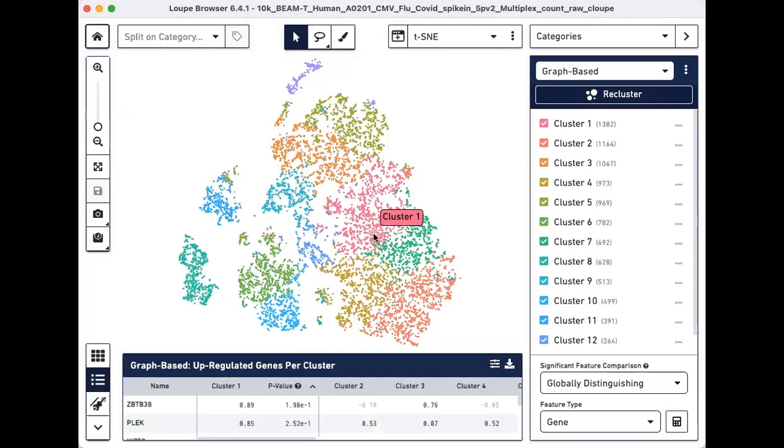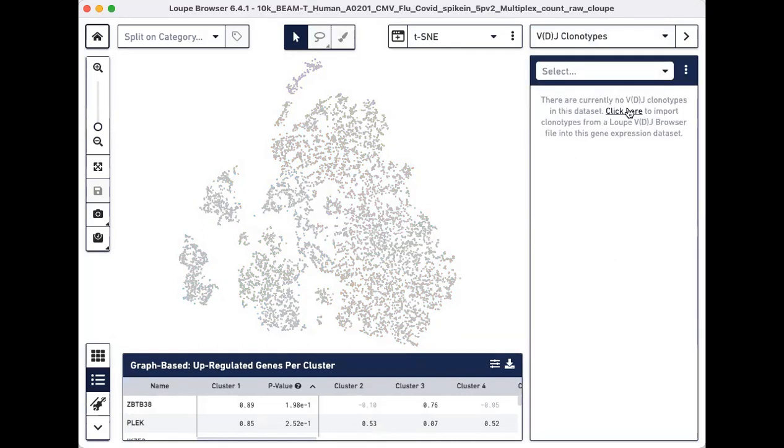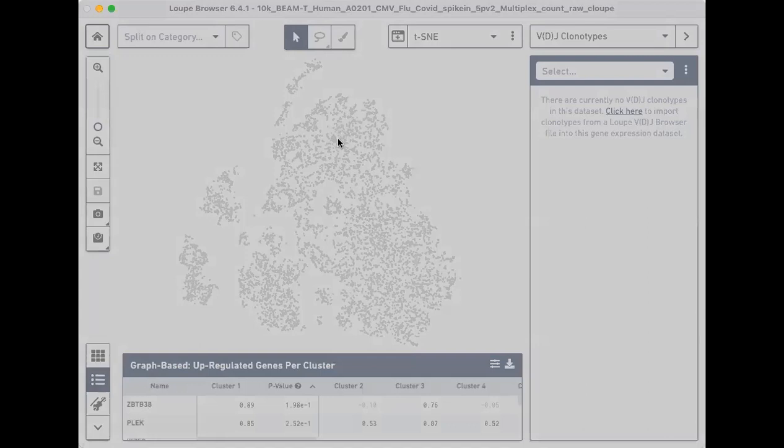Next, we will import the corresponding V loop file to overlay beam data and VDJ data onto gene expression clusters. To do this, click on the categories drop-down menu and select VDJ Clonotypes. Click on the hyperlink on the right side to select and import the correct V loop file.